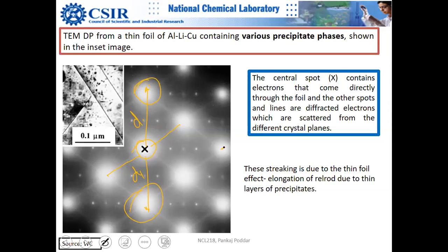So this is electron diffraction, and you can analyze it, you can calculate so many things about your sample. And you might be wondering what these tiny dots are. You can see that there is another pattern between patterns, like a superlattice. This is because there is a precipitate phase. There is a phase within the phase.